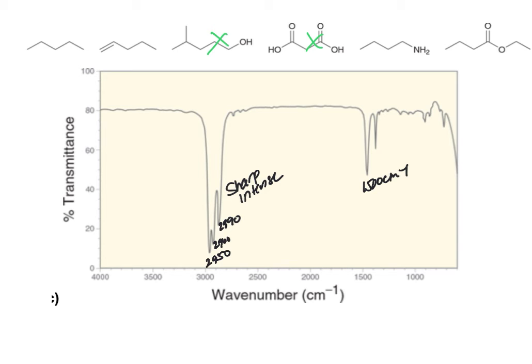So looking at this, again, not much going on. You should see that this is your CH absorption. All molecules have it. We've seen them in the previous spectra. And again, you have this non-distinct 1,500. I wouldn't say, all right, this is probably not a CC double bond. So in the table, it says an aromatic CC might show up over there, but not an isolated alkene. Just to refresh you, an aromatic would look something like that.